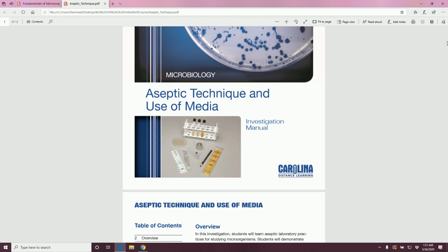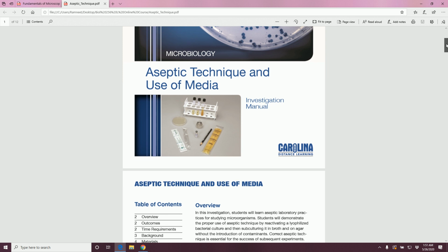So microorganisms, they're life forms. One of the very important requirements for life is nutrition, right? We all need nutrition to survive and to grow and to reproduce. So similarly, microorganisms, they're life forms, they need nutrition. If you're taking the lecture part also, you are going over all these things in the lecture part. The medium can be a liquid medium, and in these mediums is basically the nutrition. The nutrients are there on which these microorganisms grow.